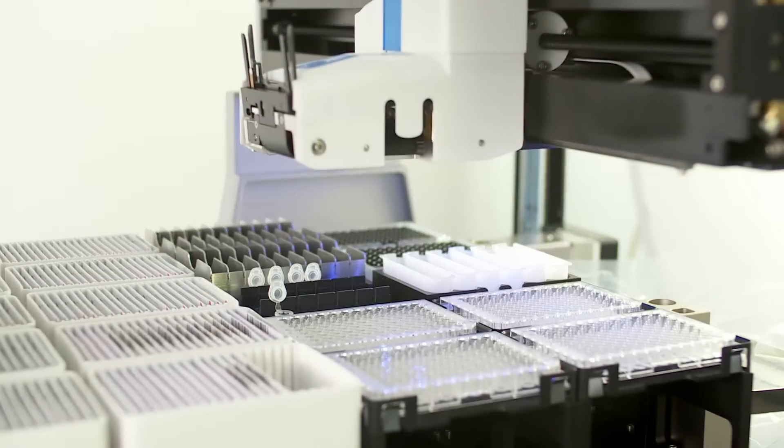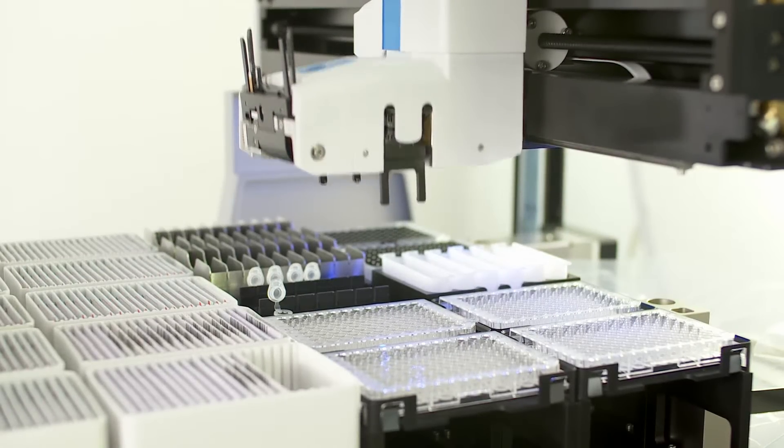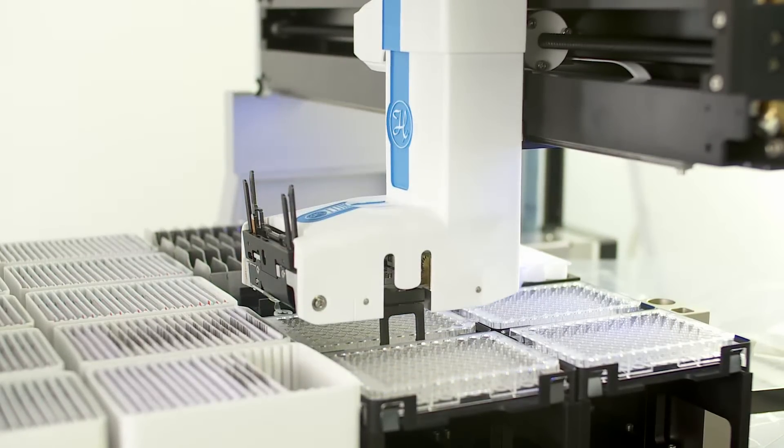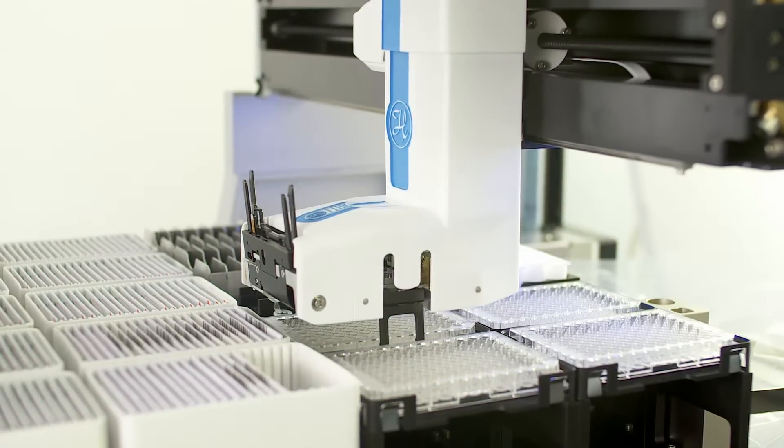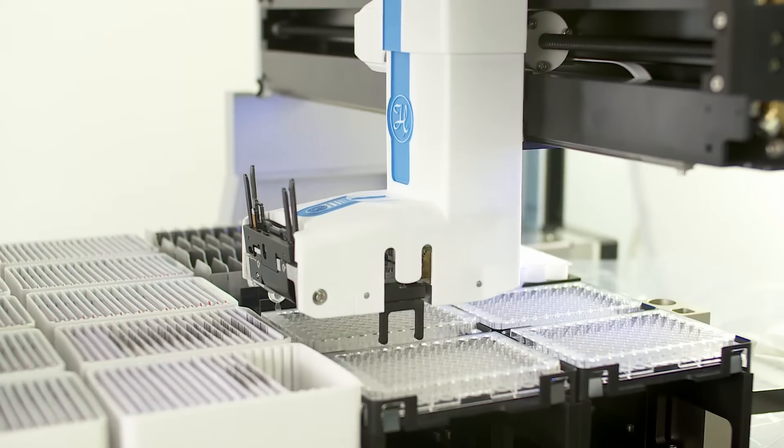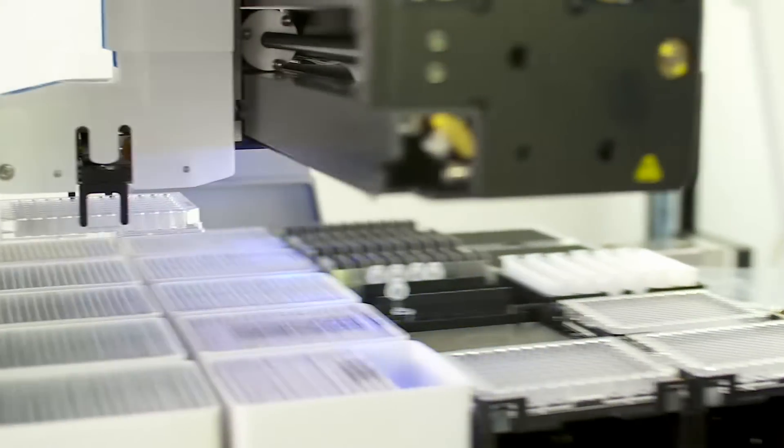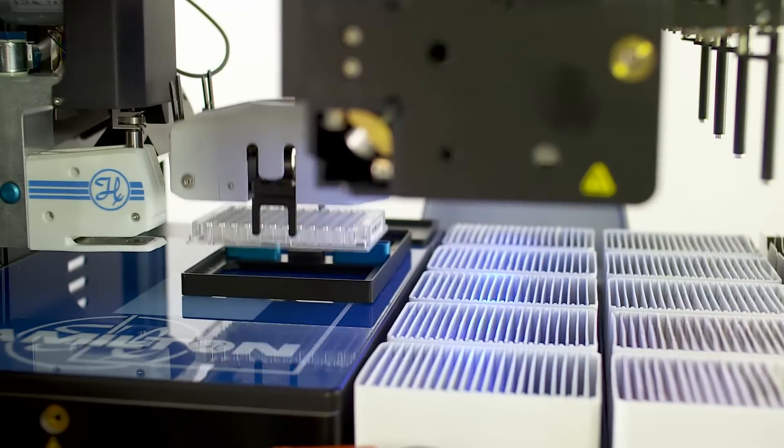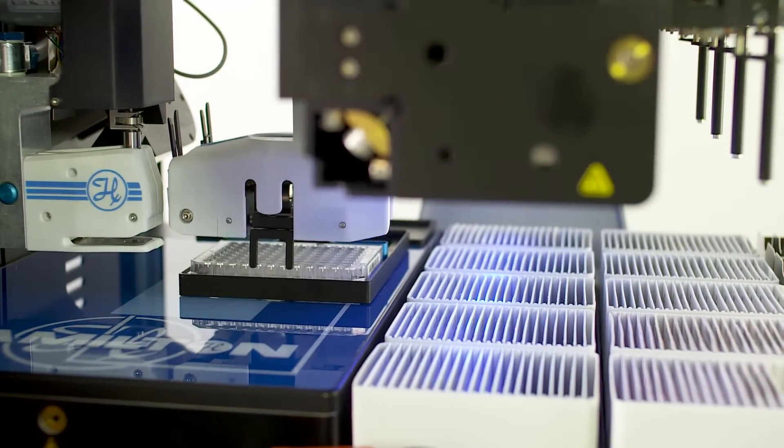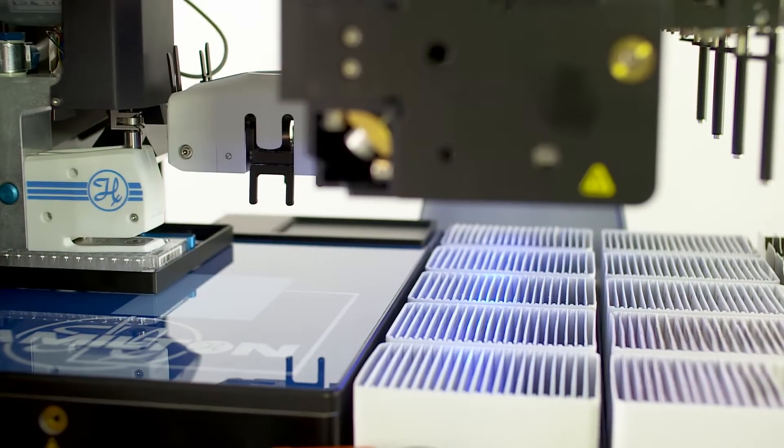The target plate is transported from its position on the deck to the punching station by a special gripper on the robotic arm. It is then placed on a plate slide moved by magnetic connections.